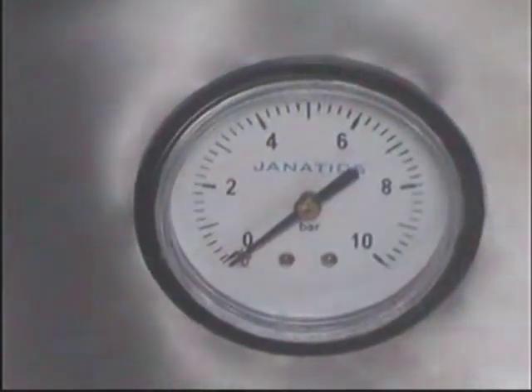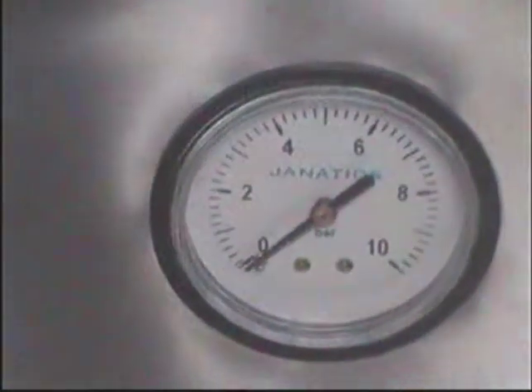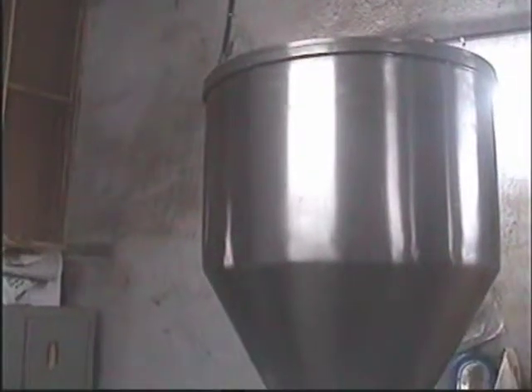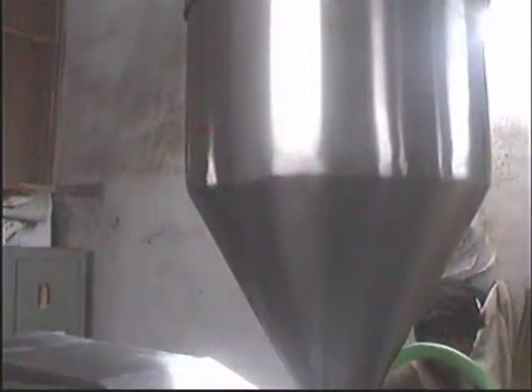Your pressure of the compressor should be around 6 kgs. You can see the hopper in which you can load your ointment — from 25 to 30 kgs.